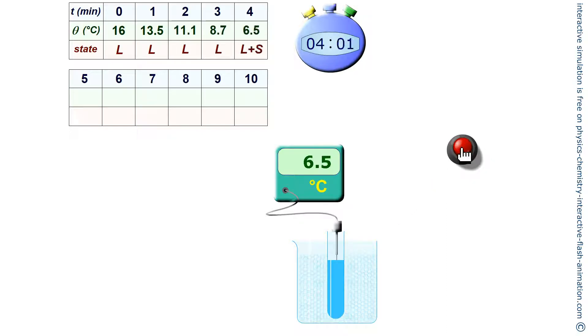I am resuming the recording now because the solidification has started. There are two states that coexist in the tube: liquid state and solid state.